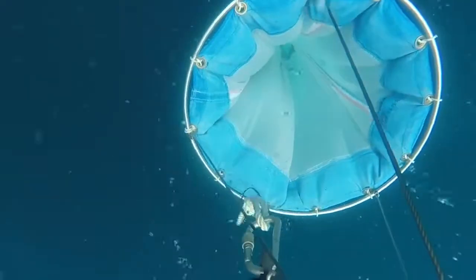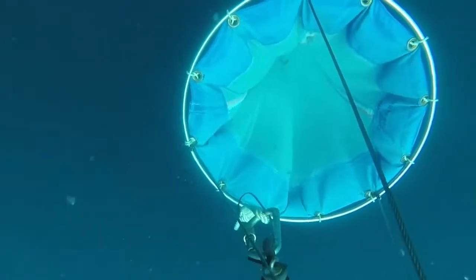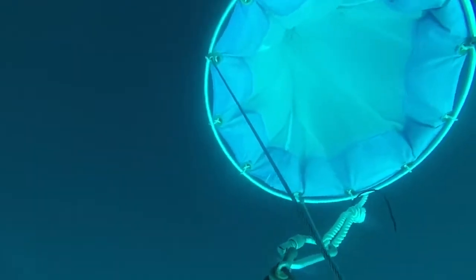When sampling for plankton in the Great Lakes, it is important to ensure that only the plankton from a specific depth are captured. Researchers deploy nets with mesh thin enough to trap tiny microscopic animals on a wire, which is lowered by a crane to a desired depth of the water column.